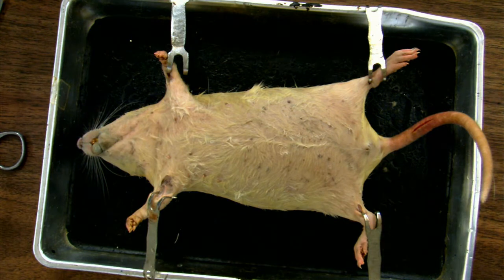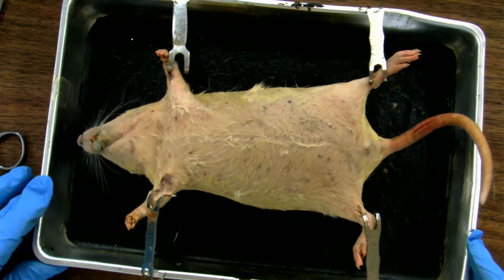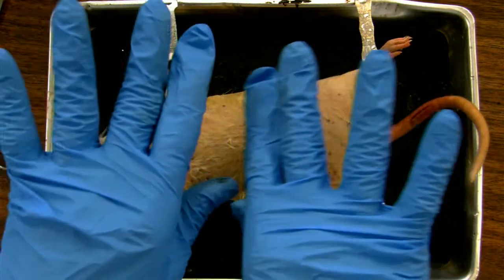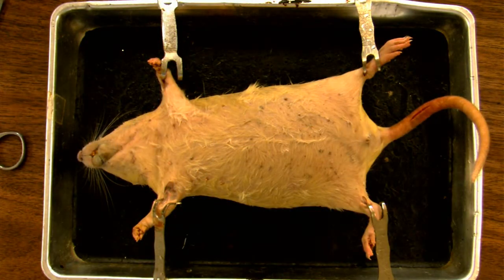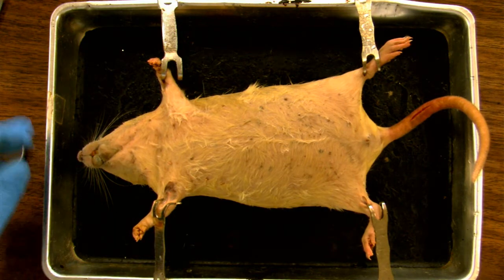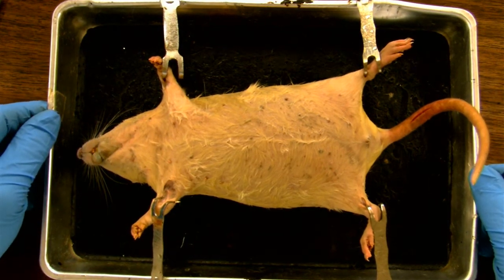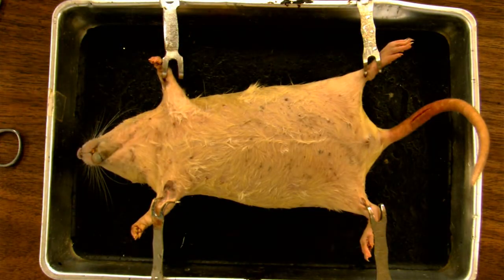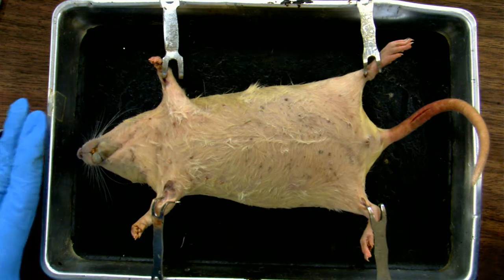Before I start cutting, I want to mention that I have taken some safety precautions. I'm wearing gloves, because this rat has been fixed in formaldehyde to preserve the tissues. I'm also wearing my safety goggles. So now let's start the dissection. I will start by opening the body wall and exposing the internal organs from the neck all the way down to the tail.